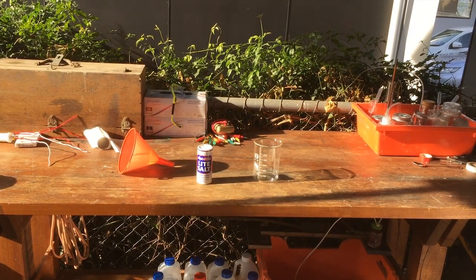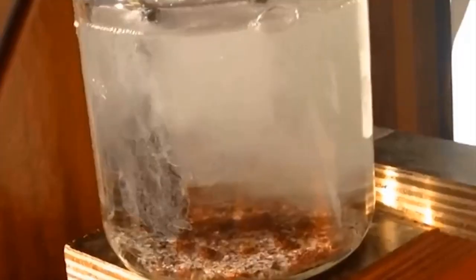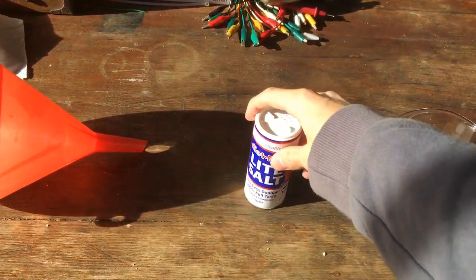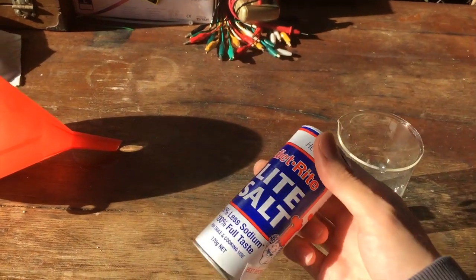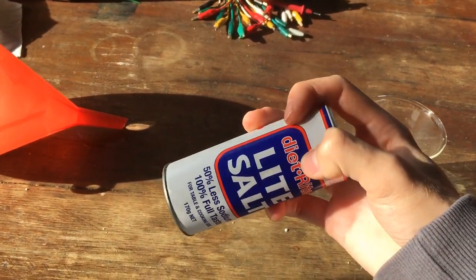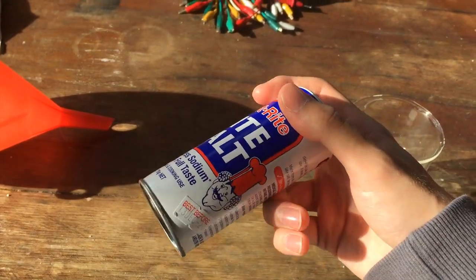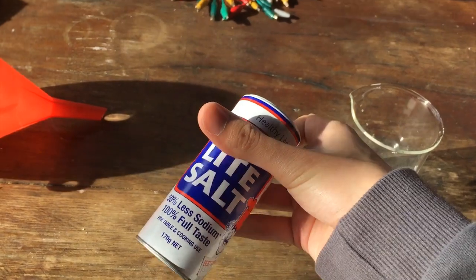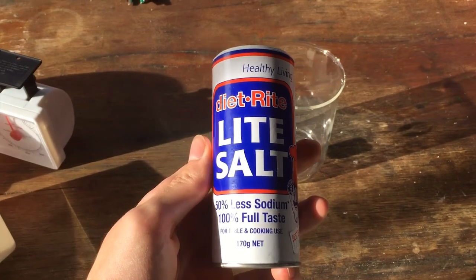Hi guys, Harry here. Welcome to Scrap Science. I have an experiment planned in the near future which requires potassium chloride, and so today I thought we'd make a short video on just crystallising the potassium chloride out of this diet salt, which apparently contains 50% sodium chloride and 50% potassium chloride. To start with I'm going to pour out around half of our diet salt.